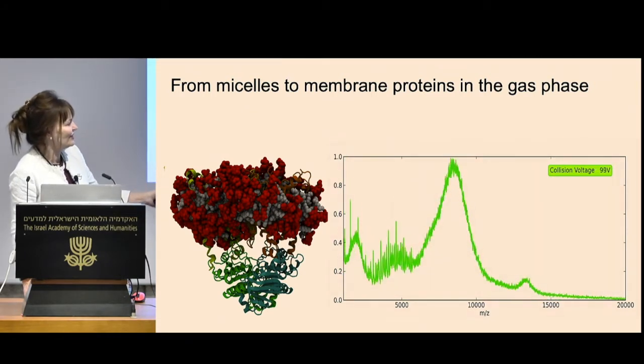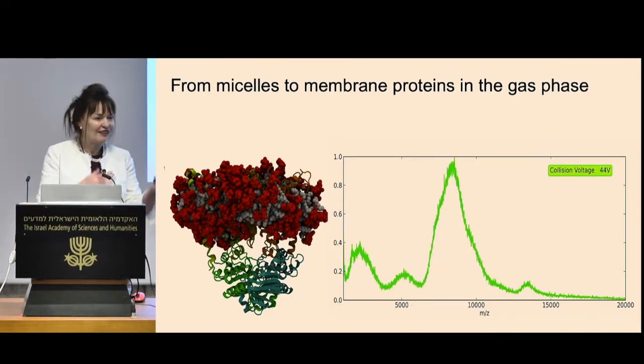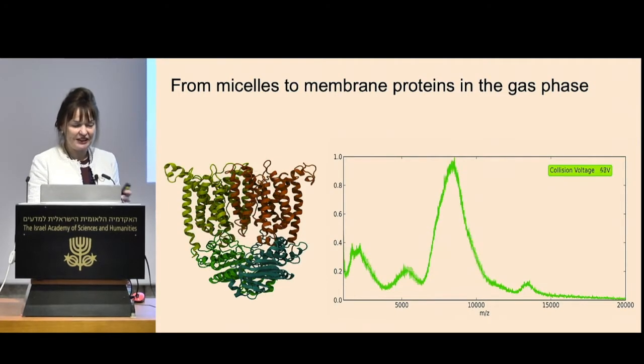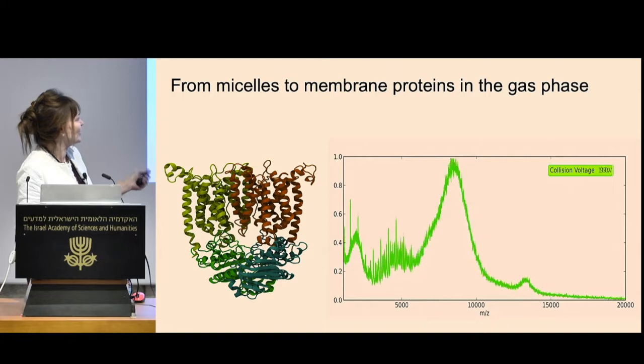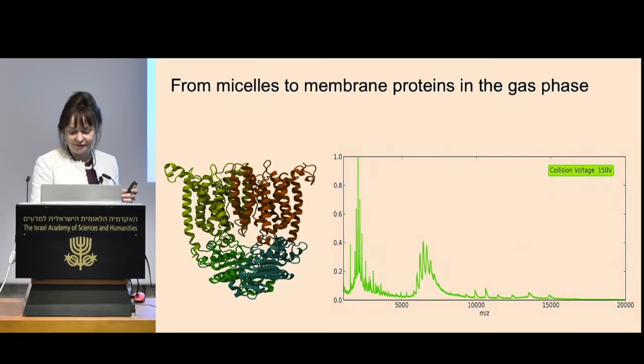And then if you don't have enough energy, you just get this really ugly, I think somebody this morning said junk, and that's kind of what it is. It's junk. It's detergent, it's lipids, it's unresolved chemical stuff. We don't really know what it is. But this is what we magically do. We shake off all the detergent and just keep the complex in the centre.